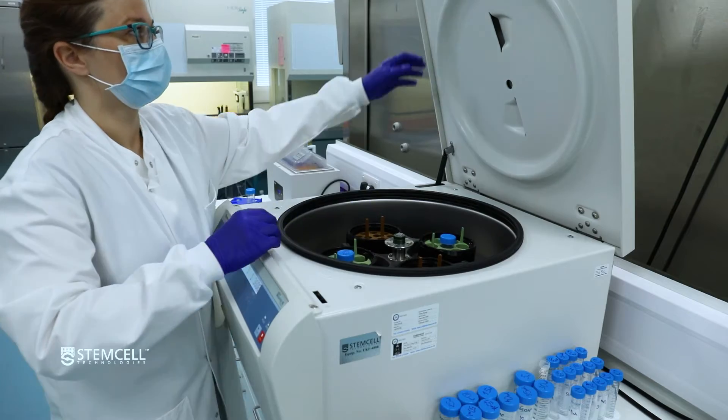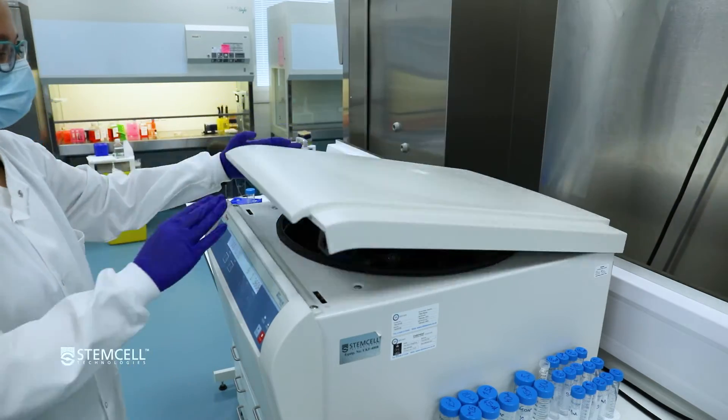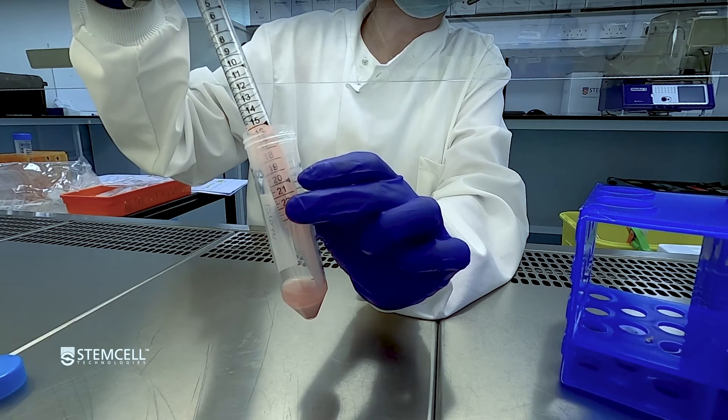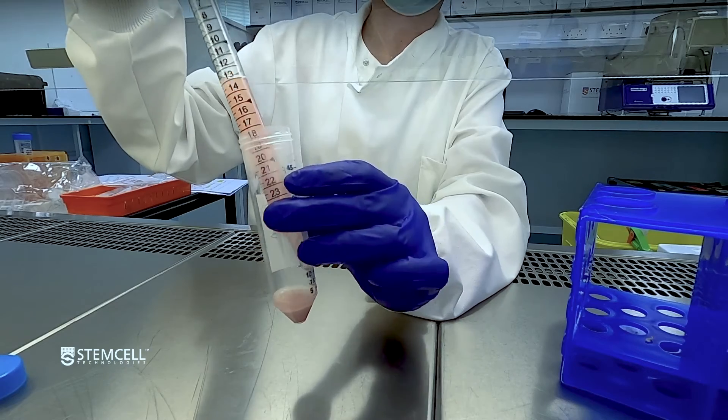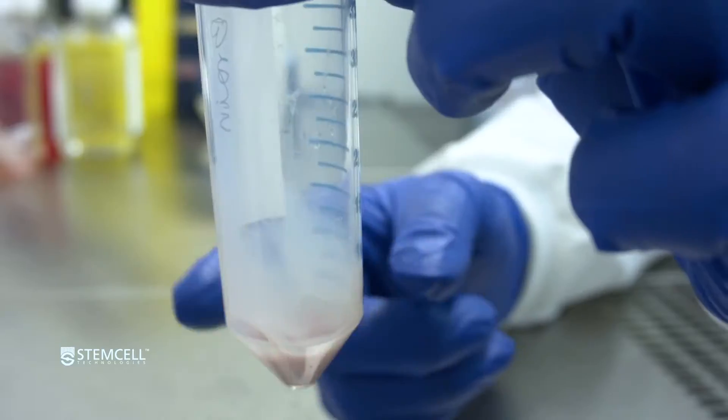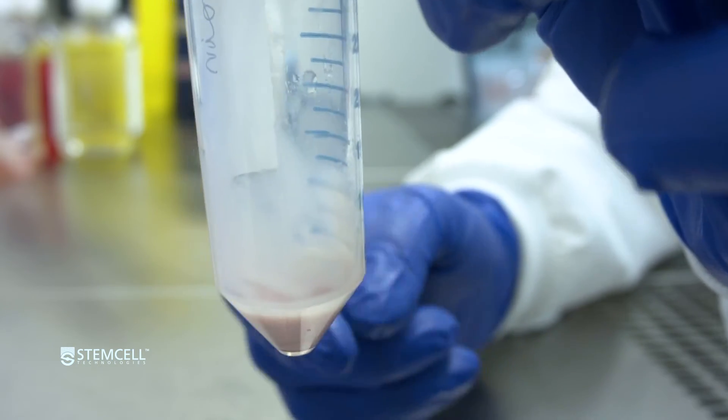Centrifuge at 300 times G for 10 minutes with the brake set to low. Using a serological pipette or aspirator, carefully remove and discard the supernatant. Gently tap the tube to dissociate the cell pellet.